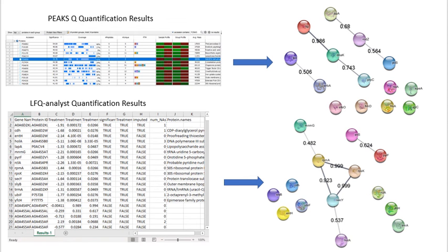From both outputs, I obtained a list of 29 proteins identified to change in abundance. Inputting these two lists into Cytoscape gave the two networks that can be seen here. Because of the variability in the outputs from LFQ Analyst, I generally had more confidence in the proteins listed from the Peaks quantification. There was only one protein identified in both quantifications, LAPA, also known as YCIS, a lipopolysaccharide assembly protein. It was shown to decrease in abundance by effectively the same amount across both platforms.